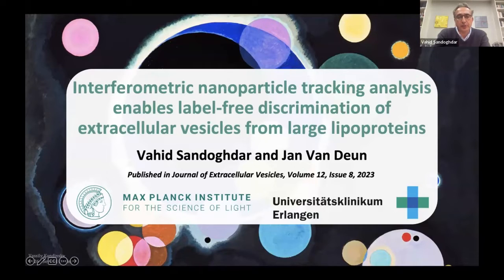So I'll be speaking the first few minutes, and we'll tell you about the method, interferometric nanoparticle tracking analysis, in short INTA, and Deun will then continue to tell you about the interesting stuff that was just alluded to regarding the lipoproteins and EV separations and distinctions.